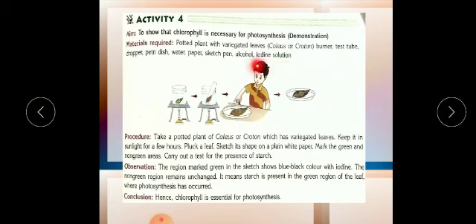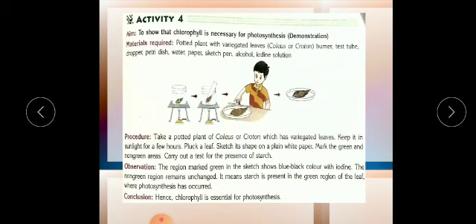We also need a burner, test tube, dropper, petri dish, water, paper, and sketch pen. The main reagents are alcohol and iodine solution. For the procedure, we take a potted coleus or croton plant with variegated leaves — half green and half yellow or brown — and keep this plant under sunlight for a few hours. Then we pluck a leaf from this plant.